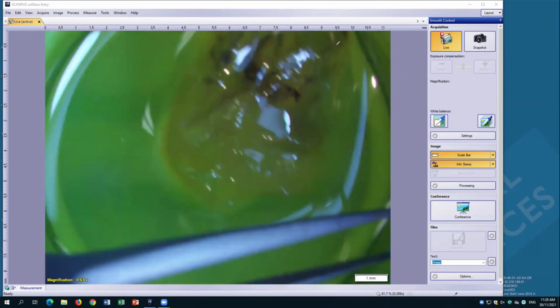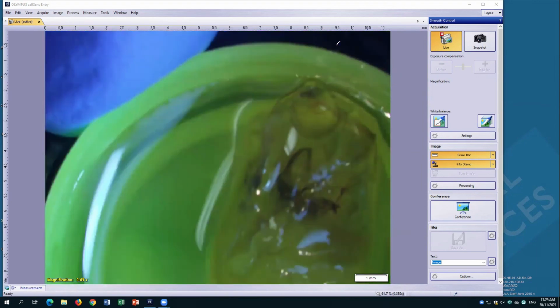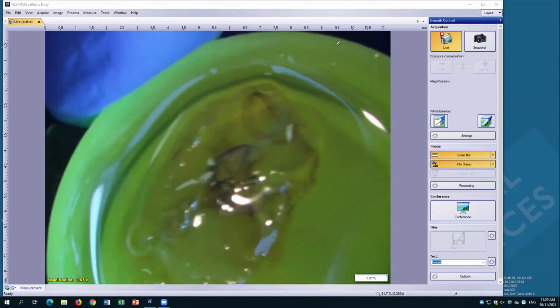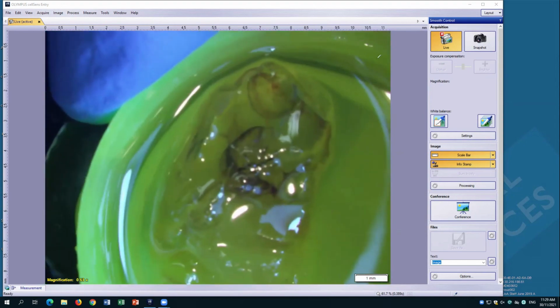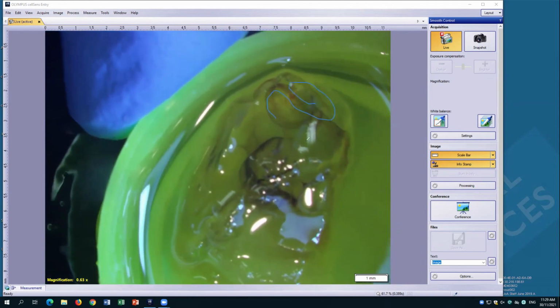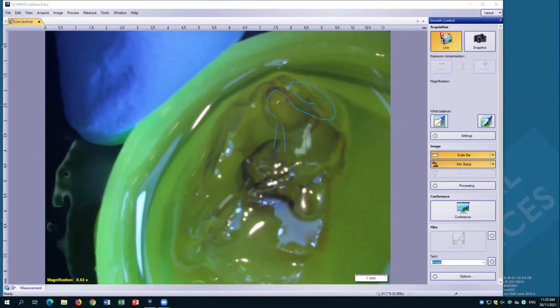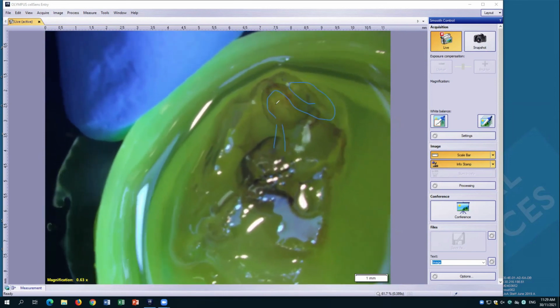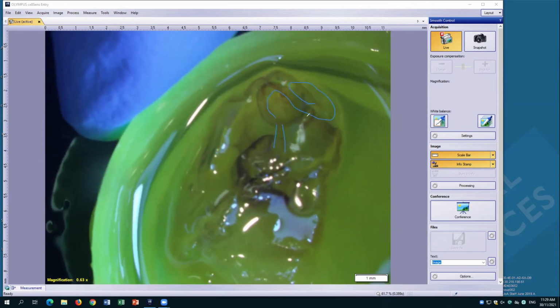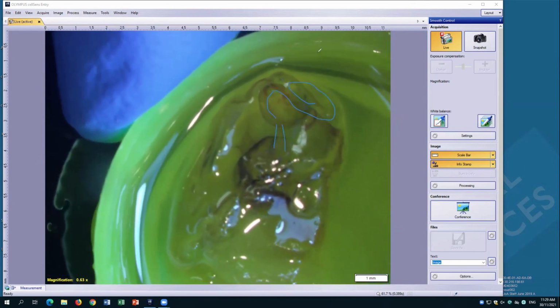See, you can see the turns now. See there? So you can see the beautiful pigmentation and the turn coming around this way, and bone is still there. So without dissecting, now what I need to do is bleach this pigment, because it's actually in the way of fluorescent imaging.